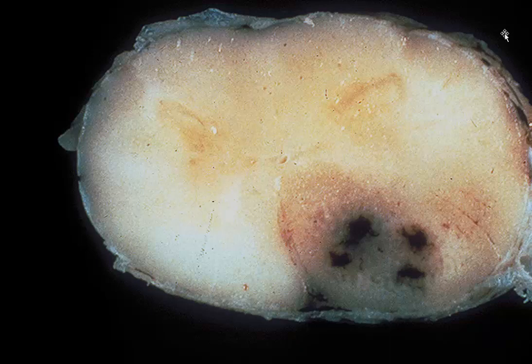And unfortunately, if you look for herpes viral inclusions, like you see in so many other herpes viral diseases, you just almost never find them. But the key is that it's pretty much exclusive to the white matter of the horse. Okay, that's the one that's exclusive to the white matter.